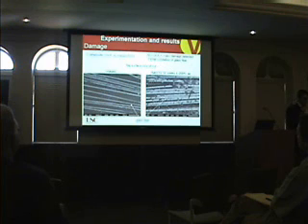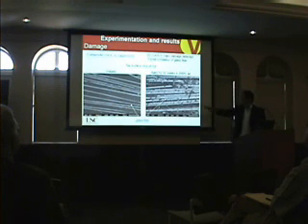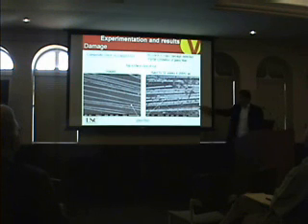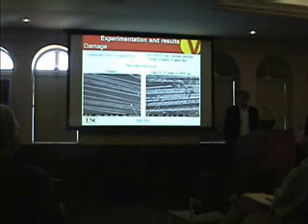Now, what happens to our material after the oxidation? So we started taking some pictures of the surface of the material. This is from the top surface view. This is unaged material. And after 52 weeks, as you see, there is an erosion of the matrix, and the matrix eroded off almost 10 to 15 microns from the surface.